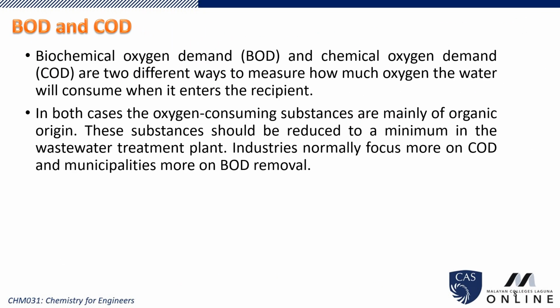Biological oxygen demand and chemical oxygen demand are used to measure how much oxygen water will consume due to pollutants. BOD measures the amount of oxygen required by microorganisms to decompose organic matter in water.